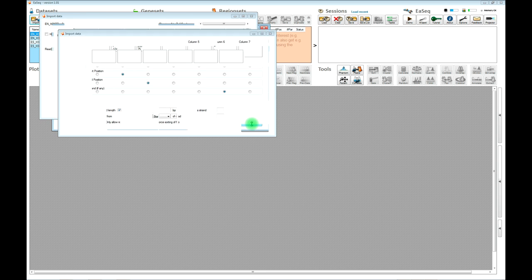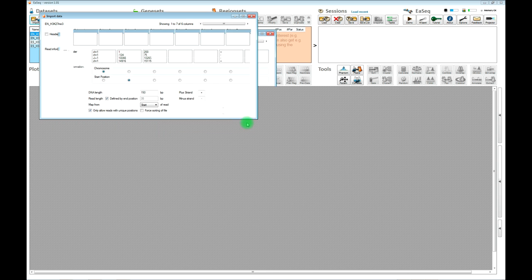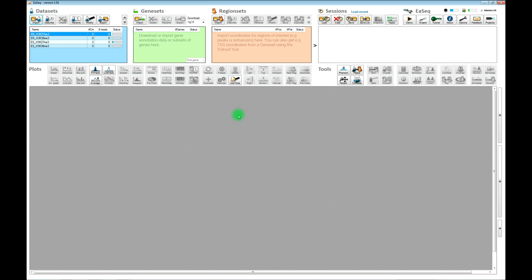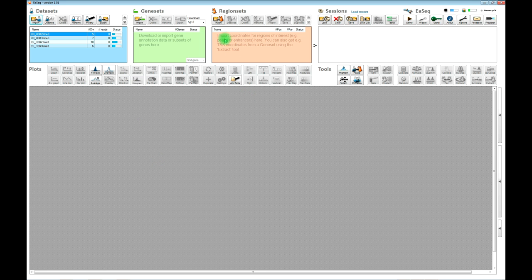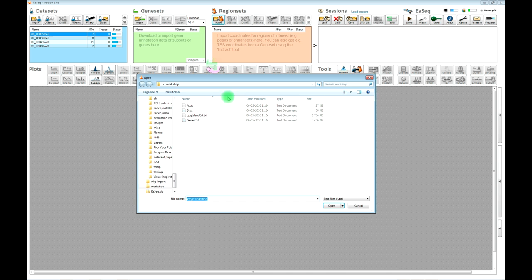We will click OK and use the default settings for all four files. Once we have done that, EASEQ will start to import the files — you can see the progress here. It does take a bit of time, so while it is doing that, we can start to import some of the region sets.